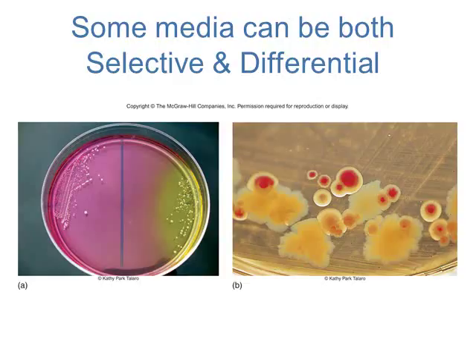It's also differential. Those gram-negative bacteria can either grow white or pink. If they grow white, that means that species cannot ferment lactose, it can't break down lactose. If it grows pink, it means that the gram-negative bacteria can ferment lactose, so it's lactose positive.